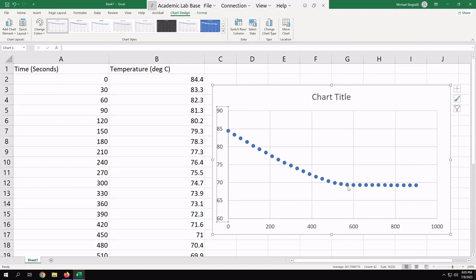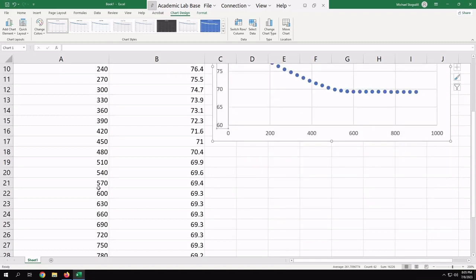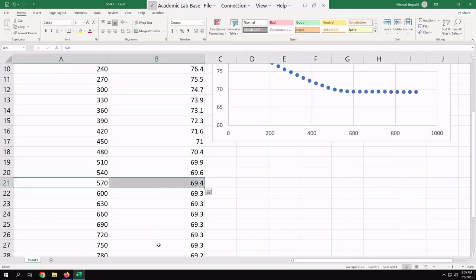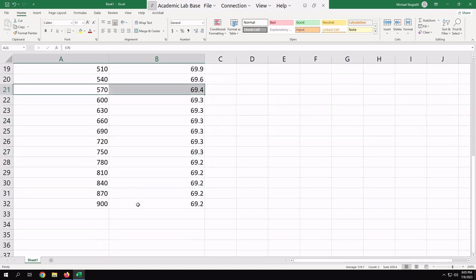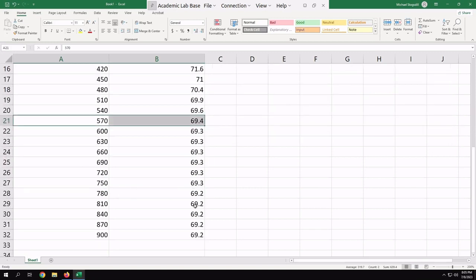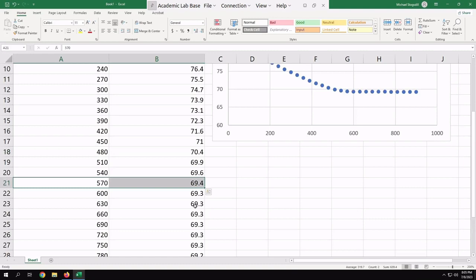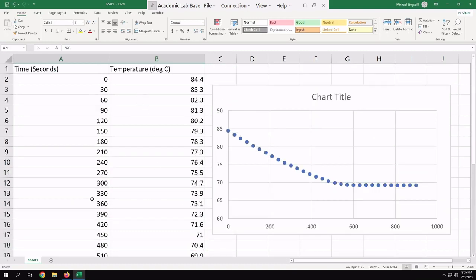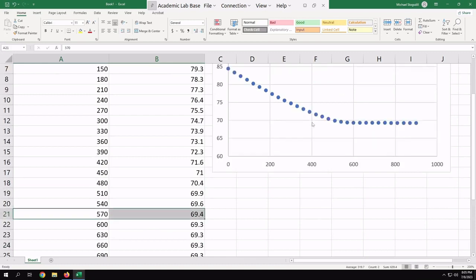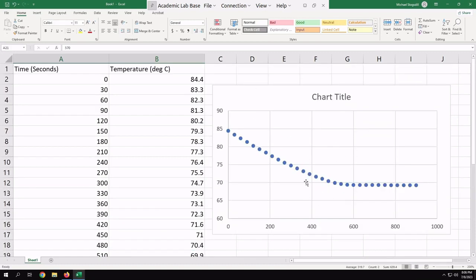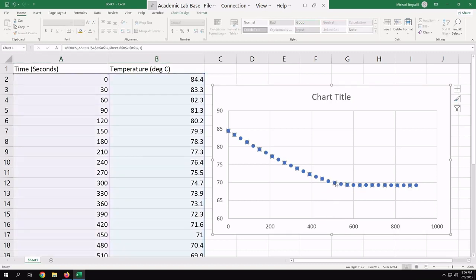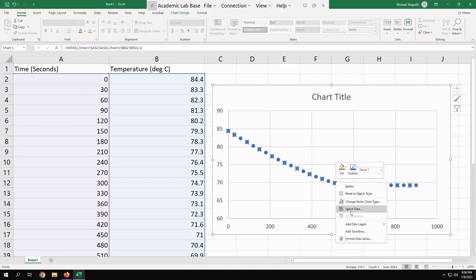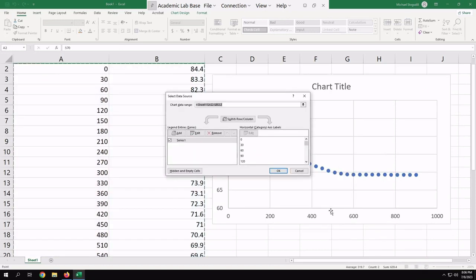It really doesn't matter. I mean this one's kind of in contention - is this in the flat one or is this in that one. It's not really going to matter a ton for this, but I would say that this is in the flat region. So what I'm going to do is I'm going to hover my cursor over that and I see that it says series 1, 570 and then it's got the point there 570, 69.4. So what that's telling us is that it's this point right here. And so this point and all the points after that are in the flat region, and all the points above it are in the cooling region. So what I need to do is actually get those into my graph as separate points.